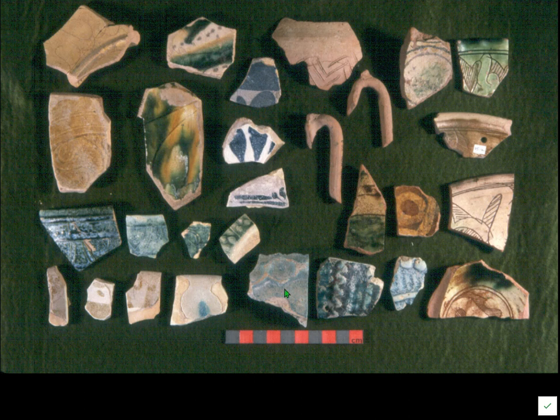And these turquoise glazed wares, these actually are not imports, were actually locally made. There were a number of attempts to photograph. These are the imports, and they would often include local wares until all this had been completely worked out. But most of these are actually imports.